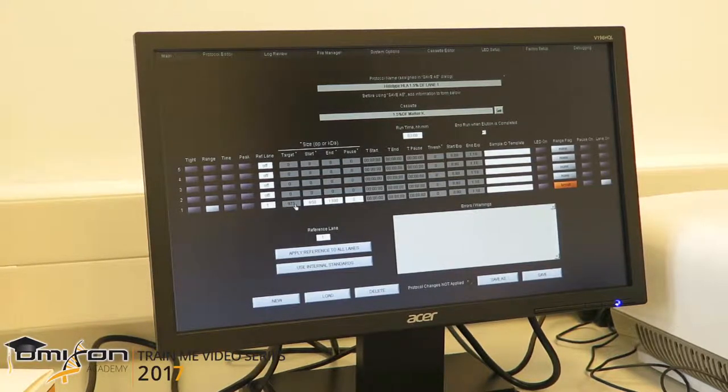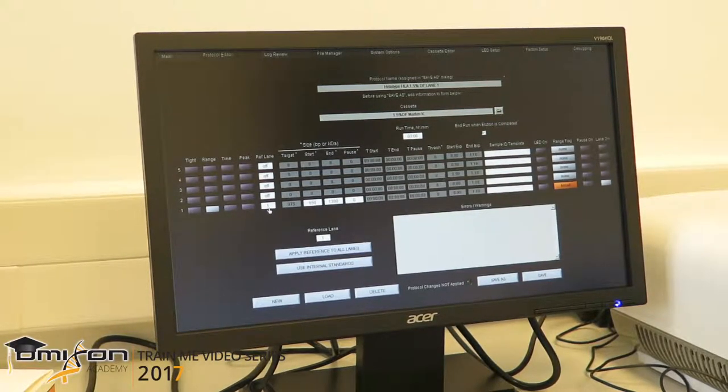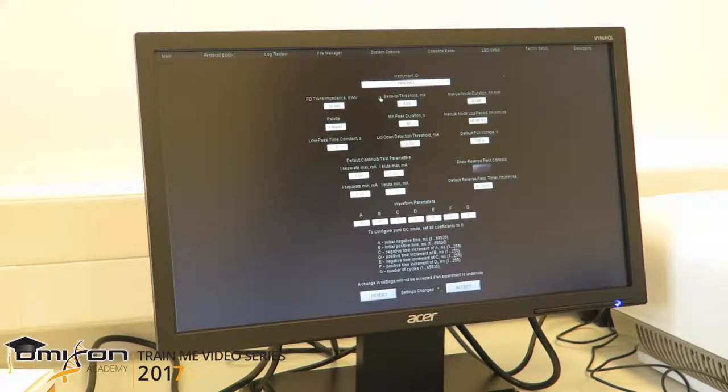The target of 975 is automatically calculated by the machine and doesn't really mean anything. What is important is to make sure that the reference lane is the same lane as the one where we will load our marker and library — this shows we are doing a broad size selection. We then go to the factory setup tab and make sure that the base-to-threshold ratio is always 0.02, and accept the change.